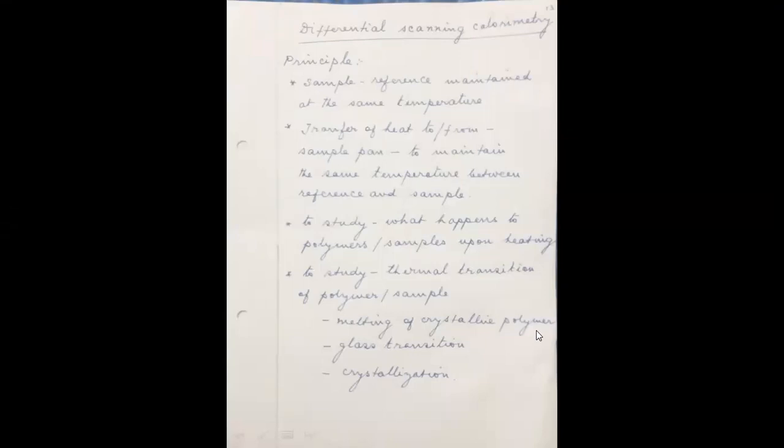You are going to maintain the temperatures of the test sample and the reference sample the same, which means that you are going to maintain the temperature difference between the sample and the substance at zero.